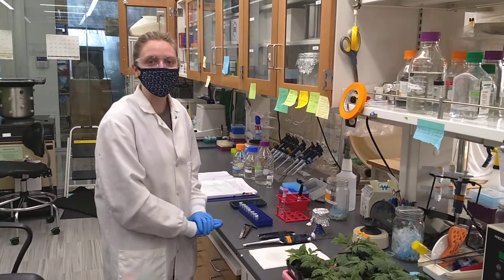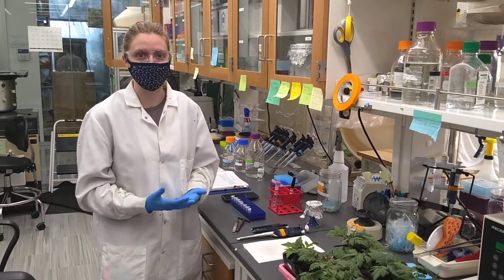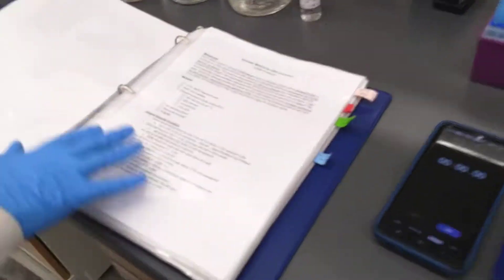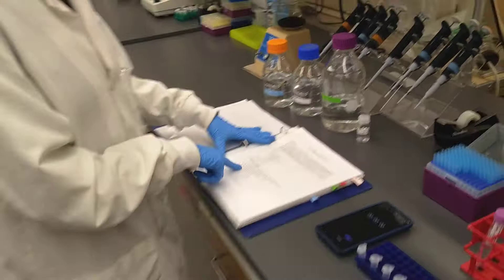Hello everybody. Today we're going to be doing an Edwards extraction. This is one of our methods that we use to do a crude DNA extraction. As you can see in our molecular biology procedures, we have a full page dedicated to the Edwards method with all the ingredients that you need.